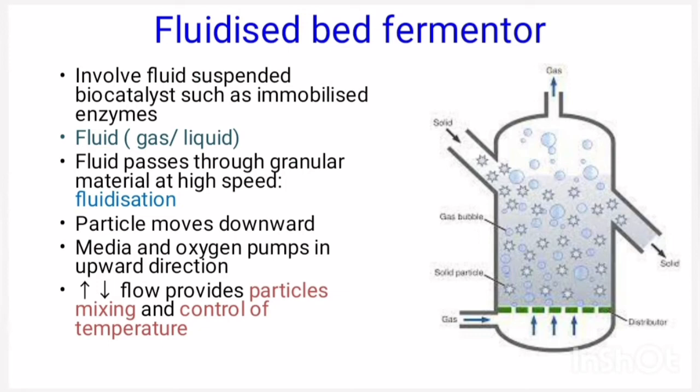Once more, the upward movement of the media and oxygen and the downward movement of the particles provide particle mixing and the temperature control. Okay.